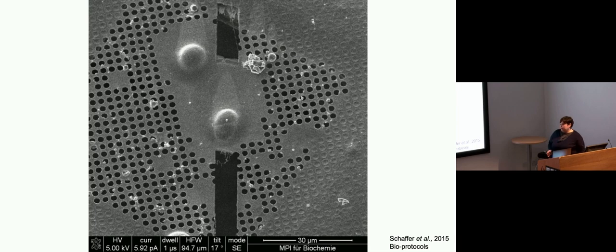You normally load your grids perpendicular. The milling direction needs to be perpendicular to the axis so that when you tilt, we have this cleared area either side so that there's nothing that shadows and gets in the way of the tilting.